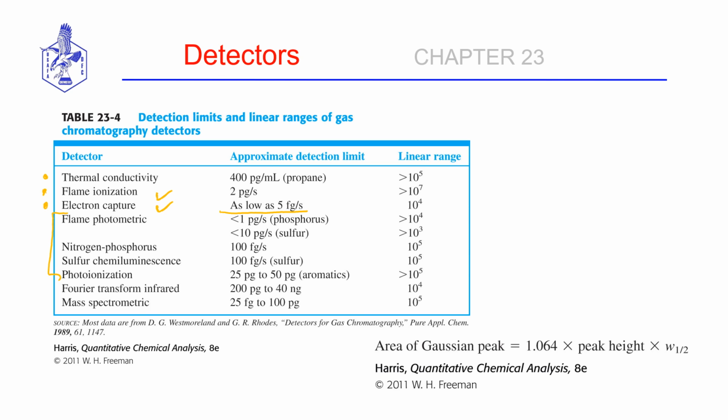So obviously nitrogen, phosphorus, sulfur here, and others. And then we have the hyphenated techniques where we interface our GC with a spectrophotometer, in which not only do we know that something comes off the end of the column, but we have a full spectrum, and we can do a positive structural identification of what that compound was.